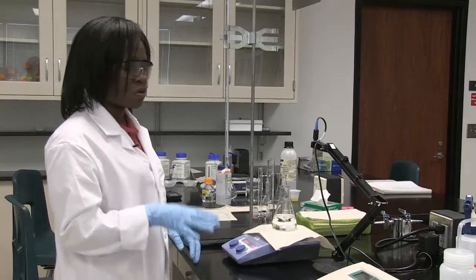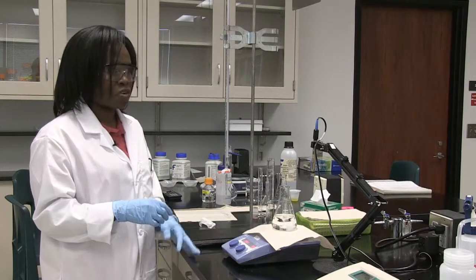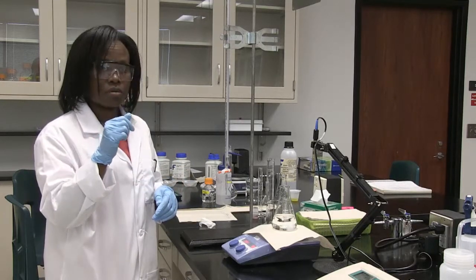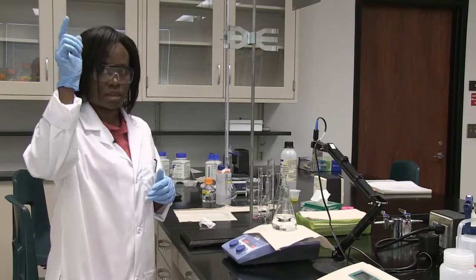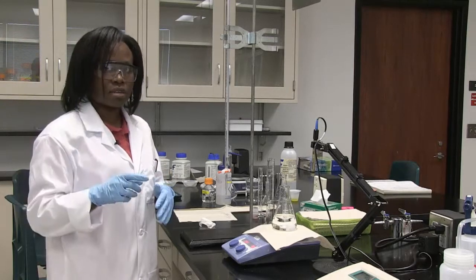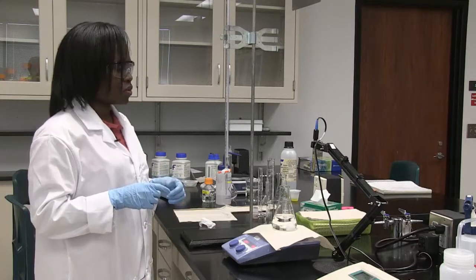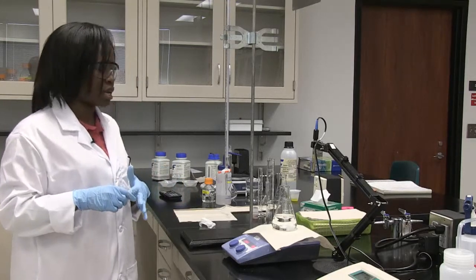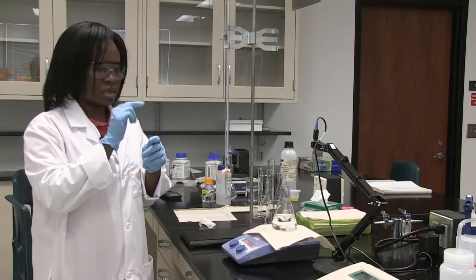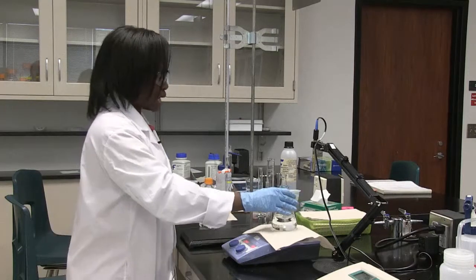The pH will continue to rise gradually until you reach a point where the buffer no longer functions normally. If you add a small amount of sodium hydroxide at that point, the pH will spike — moving from around 7 up to almost 10. You have to be careful to add only small amounts at a time, or you could miss the point where it spikes from the lower range to the higher range.